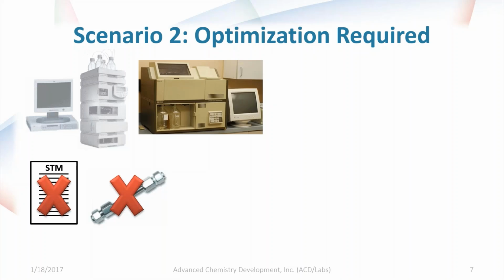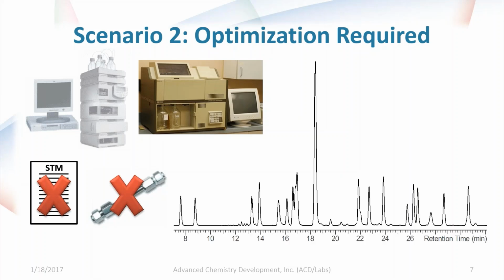Ideally, your favorite HPLC is available and the one you've got everything optimized for, but that's not always the case, and you may have to transfer to an older instrument that's there in backup, and a lot of the parameters may not be valid from your standard method. So then again, are you going to do a lot of trial and error to figure out how to best translate the method here? Or you may be trying to go from an HPLC to a UHPLC. And again, how are you going to go about trying to start this?